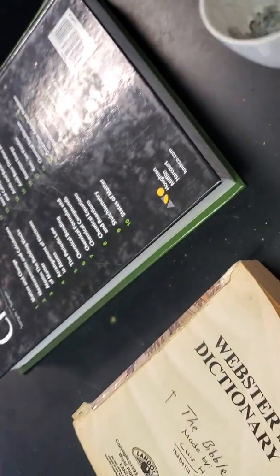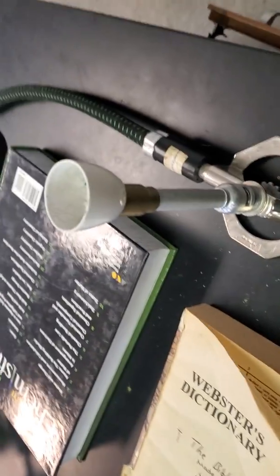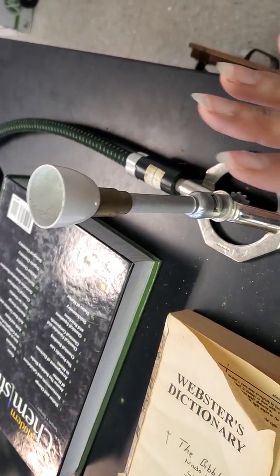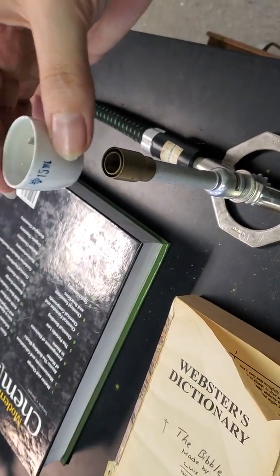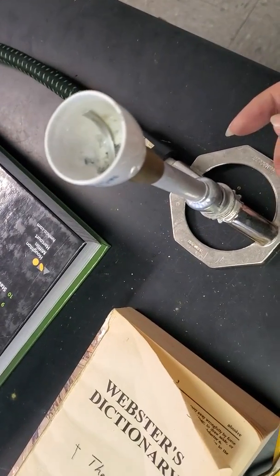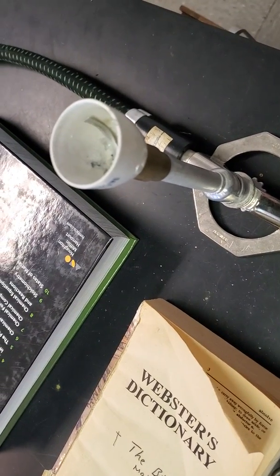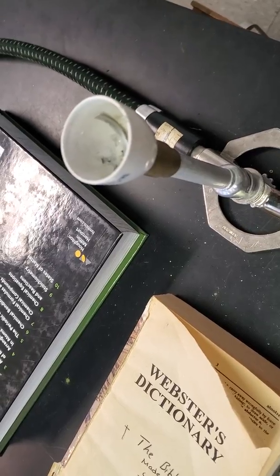So the way that I'm going to combine magnesium and oxygen is by taking the piece of magnesium metal and putting it inside of a crucible, like that. Then I'm going to have a ring stand. I don't have the ring stand right now, but if I did, I would put the crucible over the Bunsen burner, not like that. This is just because I don't have a ring stand. The ring stand would hold it up at a certain height, but I don't have it. And what happened is that the Bunsen burner flame would heat the bottom of the crucible, and then the magnesium would react. If there's heat, that magnesium will react with the oxygen in the air and form a product called magnesium oxide.